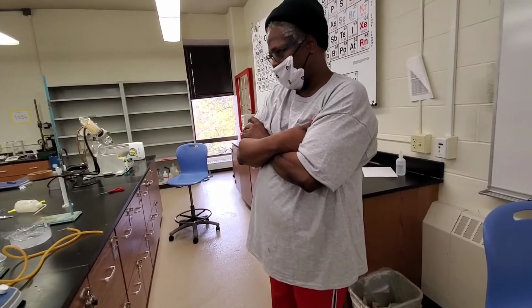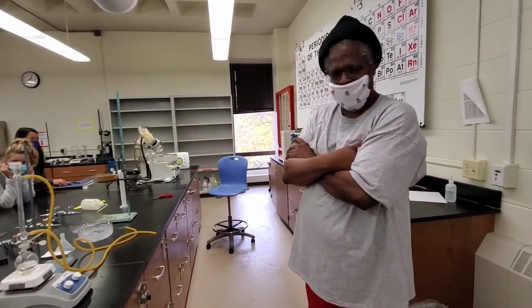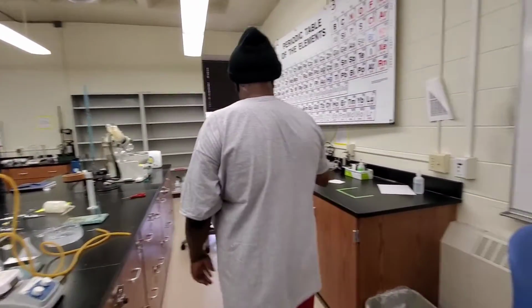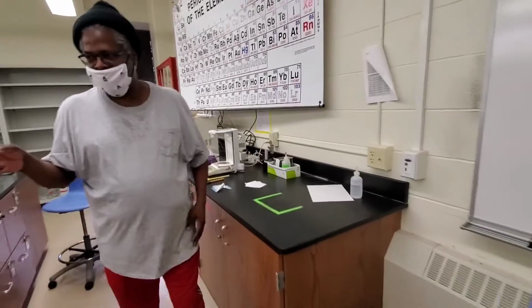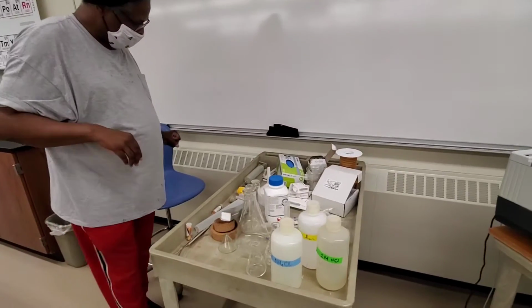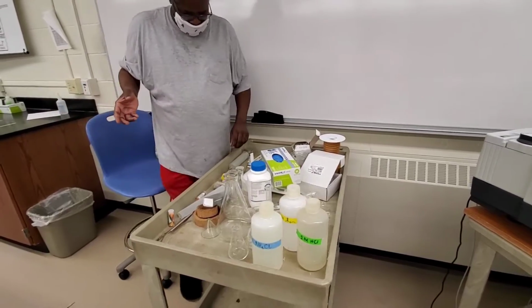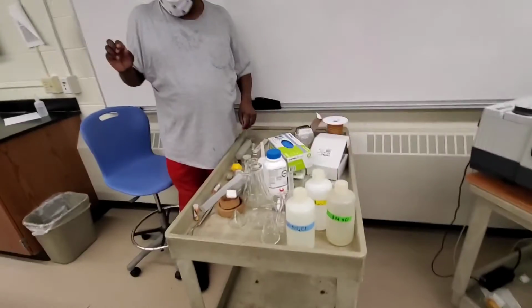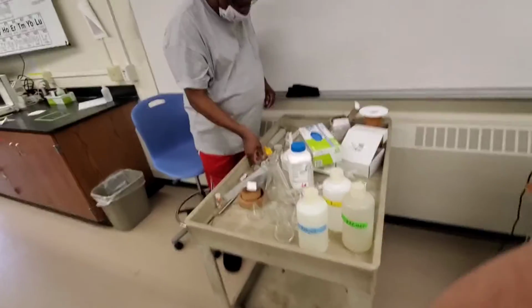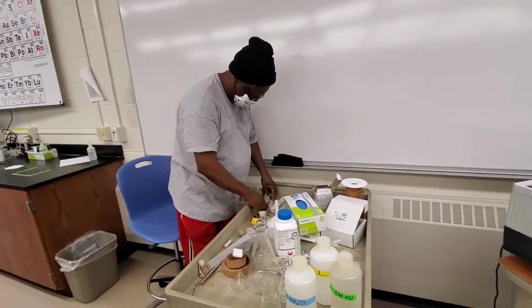So let's assume that I think a couple of other things. You saw how I weighed stuff on the balance, but in some cases you're going to use liquid reactants, and for those, except for the solvent, unless I tell you to syringe it, for the solvent you mostly use measuring cylinders. For reactants that are liquids, what you would be using are syringes.